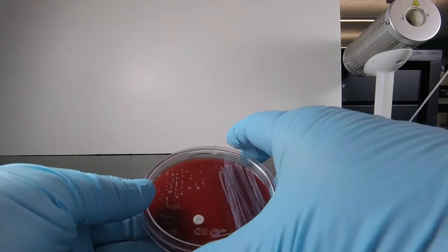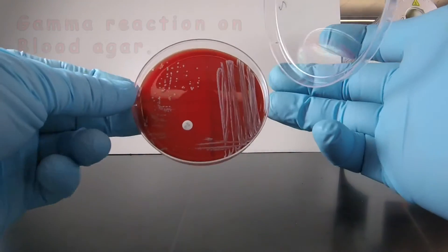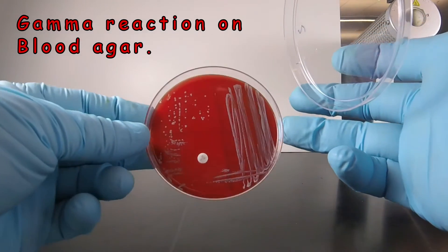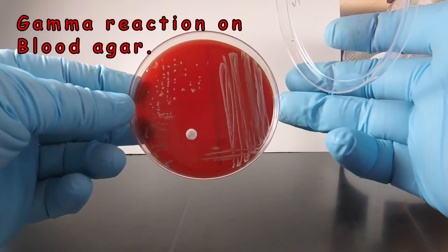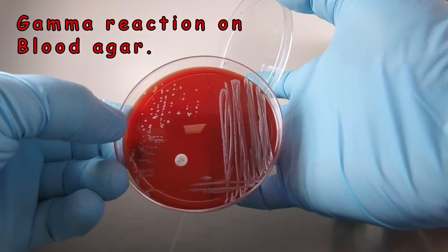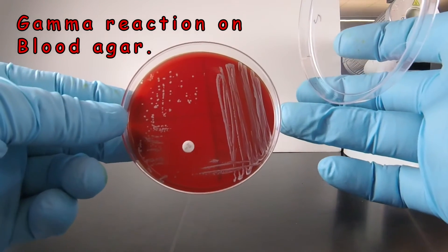First of all, we see that there is no hemolysis on the blood agar. If we hold the plate up and tip it a little bit, we see there's no greenish discoloration like we'd see in alpha, and there's no beta hemolysis where the red blood cells are lysed. The blood agar still looks like blood agar under the colonies and where the growth is. So that's what we call a gamma reaction.